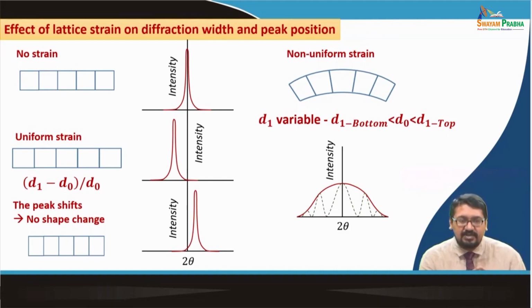Now, you see that whenever we are doing diffraction and at a particular theta a peak is coming, that theta angle, the Bragg's angle theta, is basically a representation of that particular HKL plane, right. So, when the metal has no strain at all and it is in the nascent state, then the interplanar distance d should be what it should have for that particular theta, right.